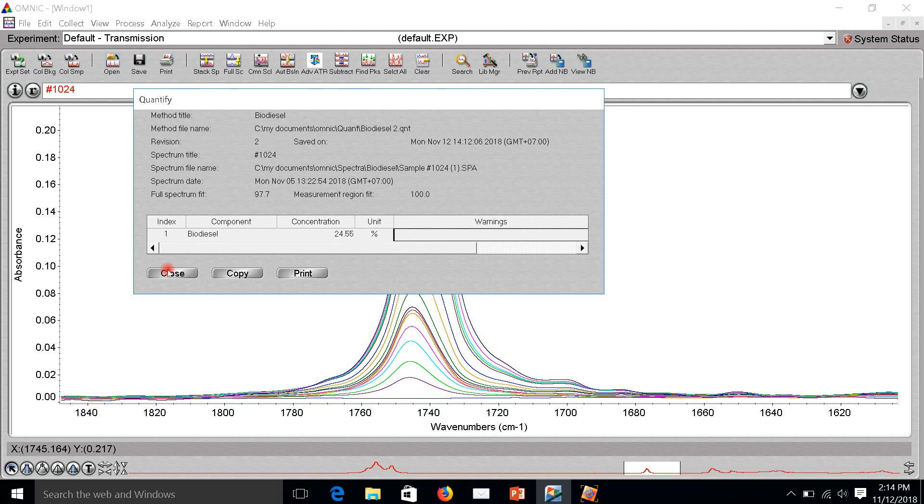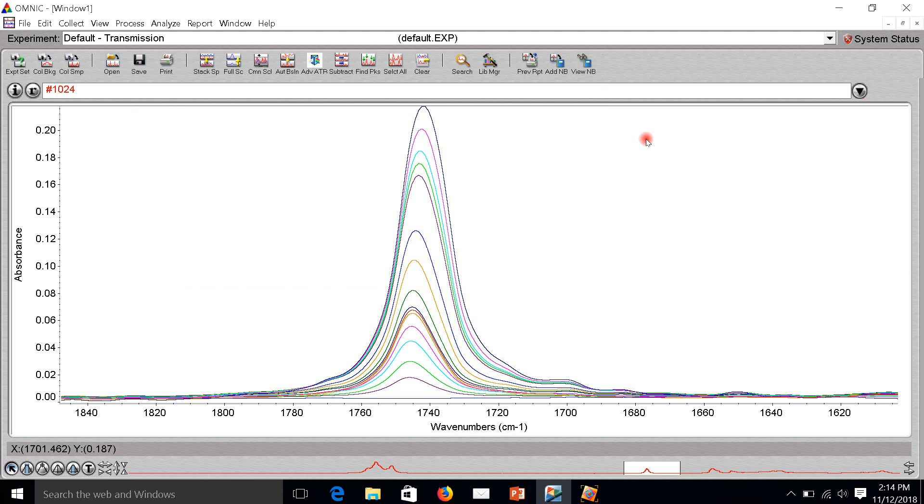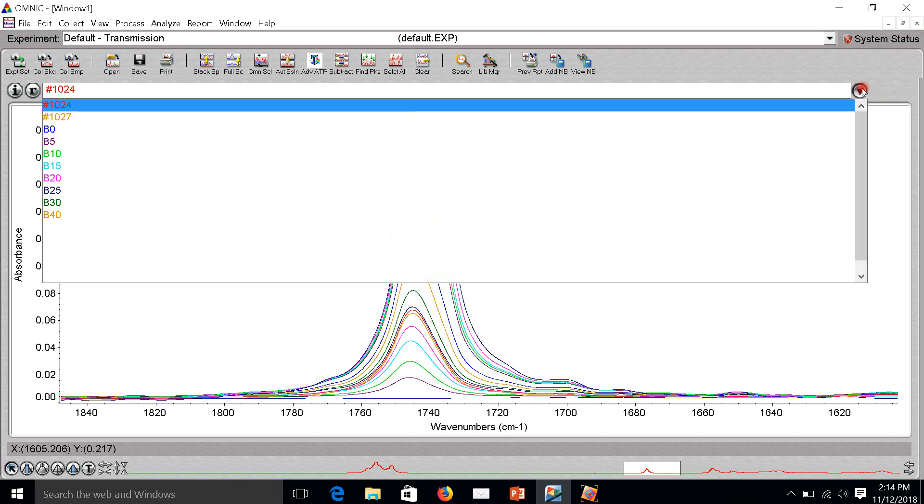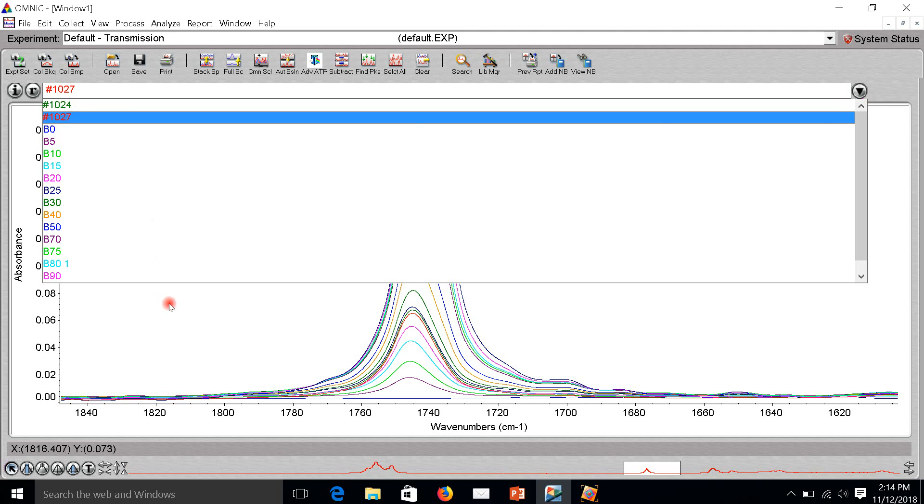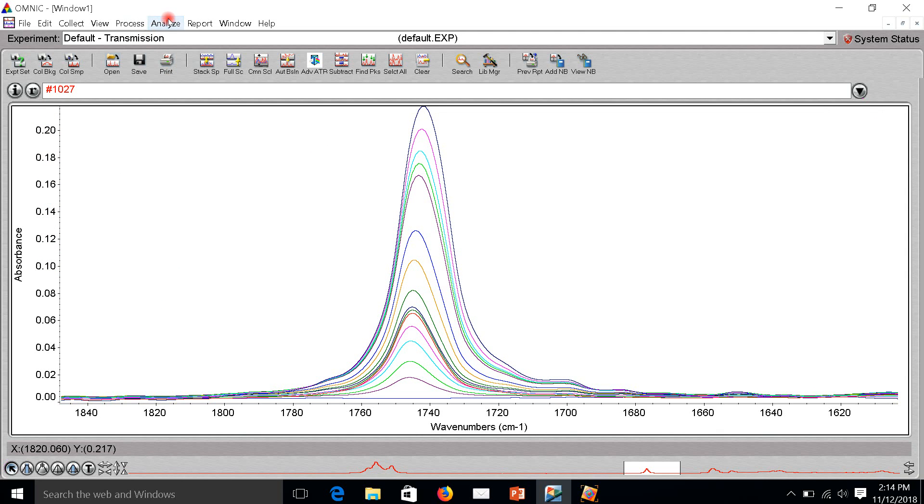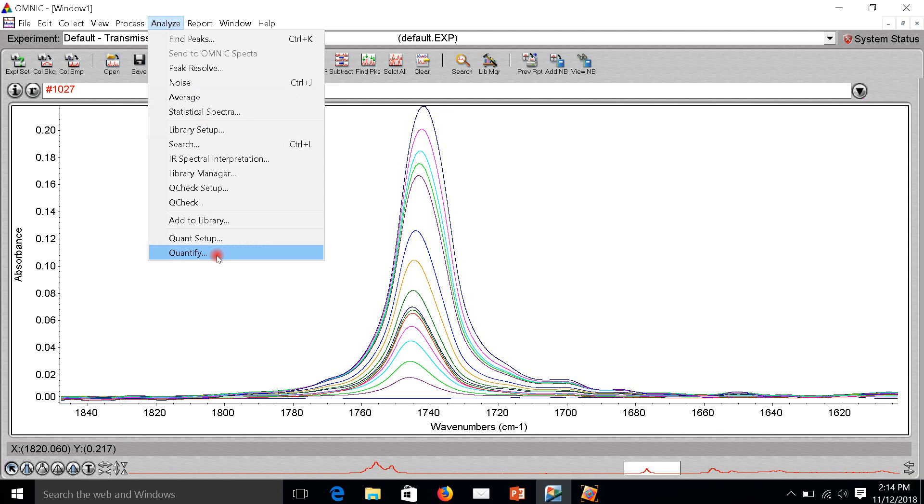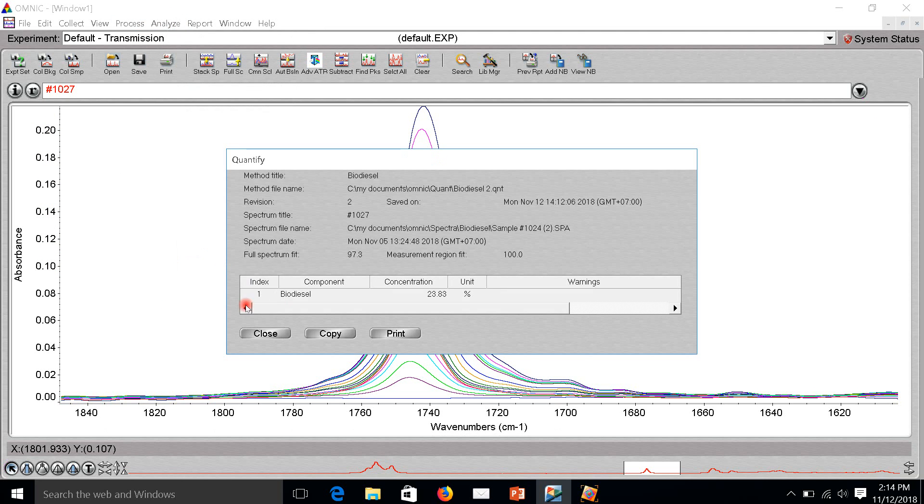Now we're going to another sample, B25. This is the concentration, the unit is percentage.